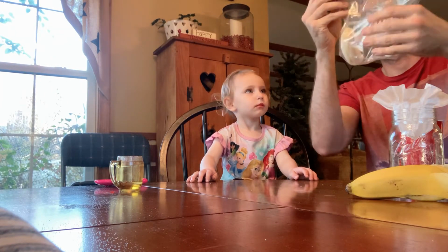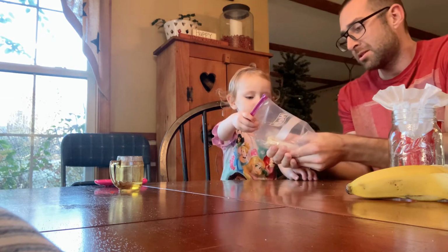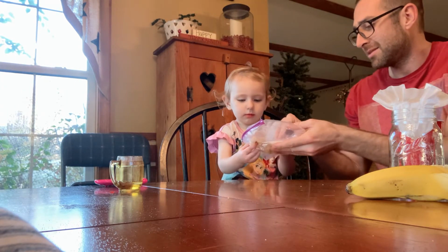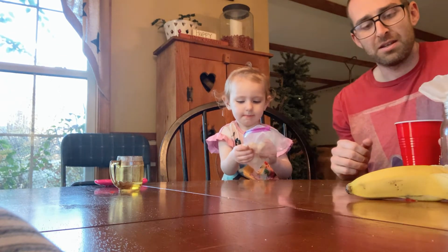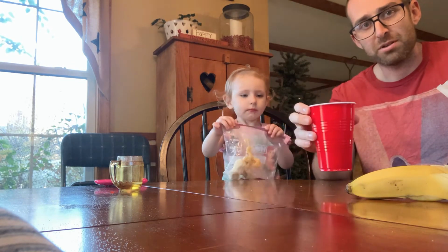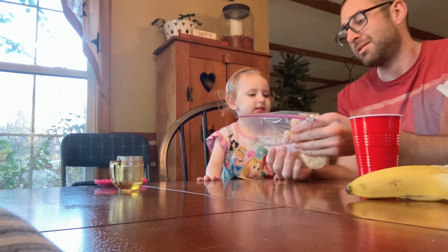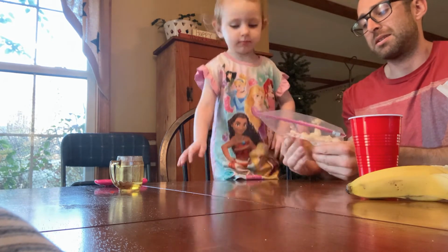Now, can you mush this? So keep it in the bag and just mush it like that. Can you do that? There you go. Yeah, squeeze it. It's kind of fun, right? So while she does that, we need half a cup of water, and I have a teaspoon of salt dissolved in it. So you mush it like that.